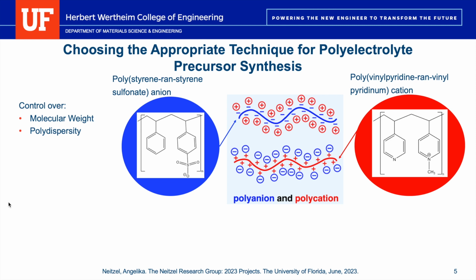The closer to 1, the better, as it indicates most polymers in a solution are pretty close to having the same molecular weight. The greater the value, the more dispersed the molecular weight is, which makes it difficult to study the unique properties that polymers have if you can't determine what molecular weight is causing that property.